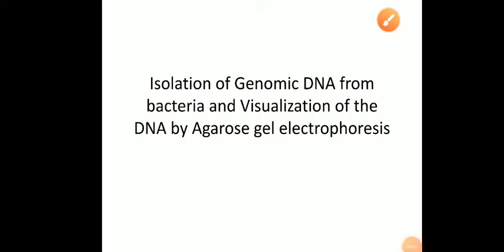Good afternoon, students. The next practical that we are going to discuss is isolation of genomic DNA from bacteria, especially isolation of genomic DNA from E. coli, and whether you have successfully isolated the DNA or not. That can be checked by visualization of the DNA on agarose gel. That means you first isolate the genomic DNA from E. coli by following various steps and then perform agarose gel electrophoresis of the DNA and visualize it.